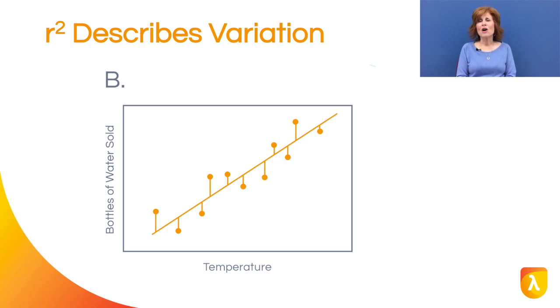So, applying R² to your data for linear range determination really only tells you about variation in signal intensity that can be attributed to your sample protein concentration and variation that is caused by something else.